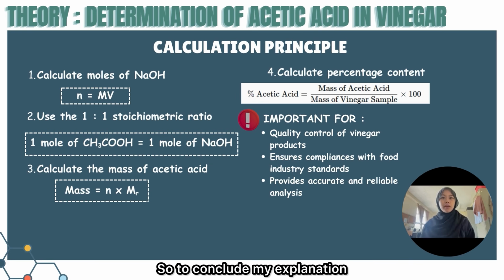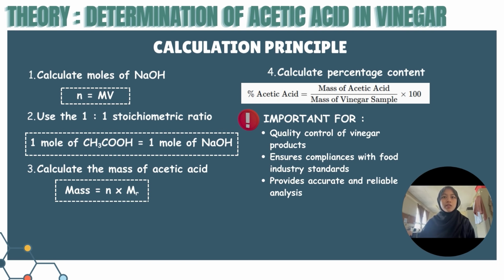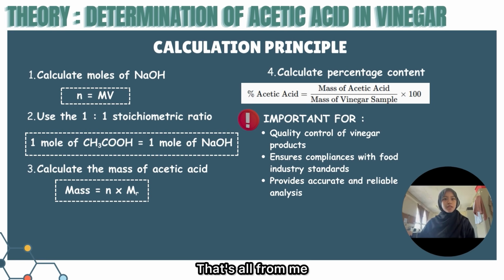So to conclude my explanation, this analysis is very important because it is widely used for quality control of vinegar products, ensuring that they meet food industry standards and that the labeled acetic acid concentration is accurate and reliable. That's all from me. Thank you.